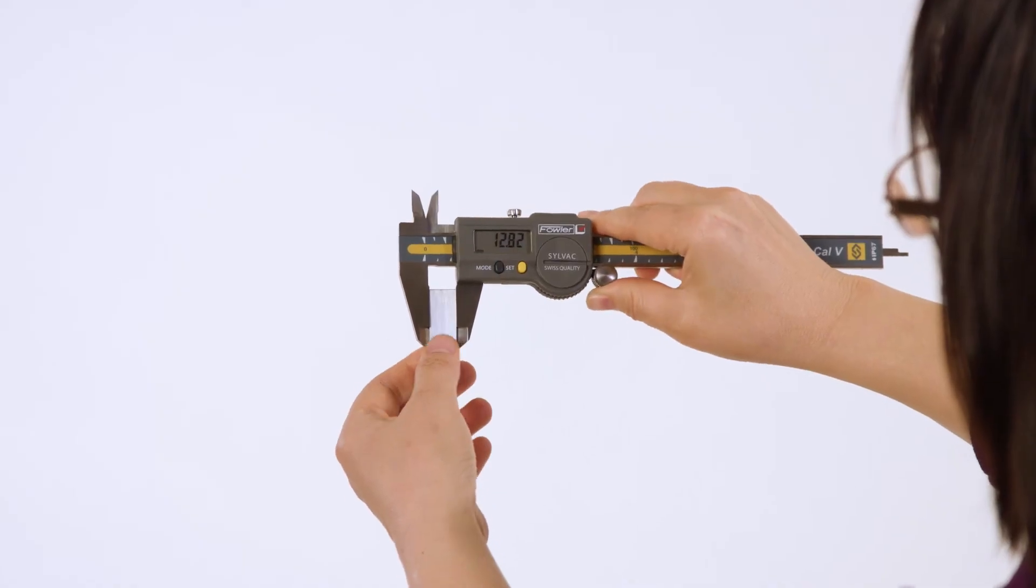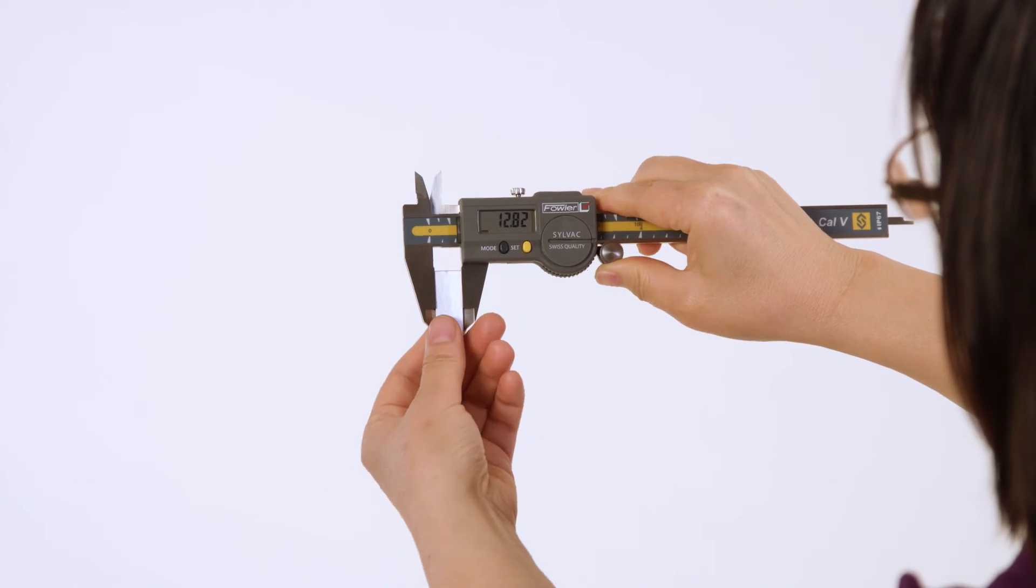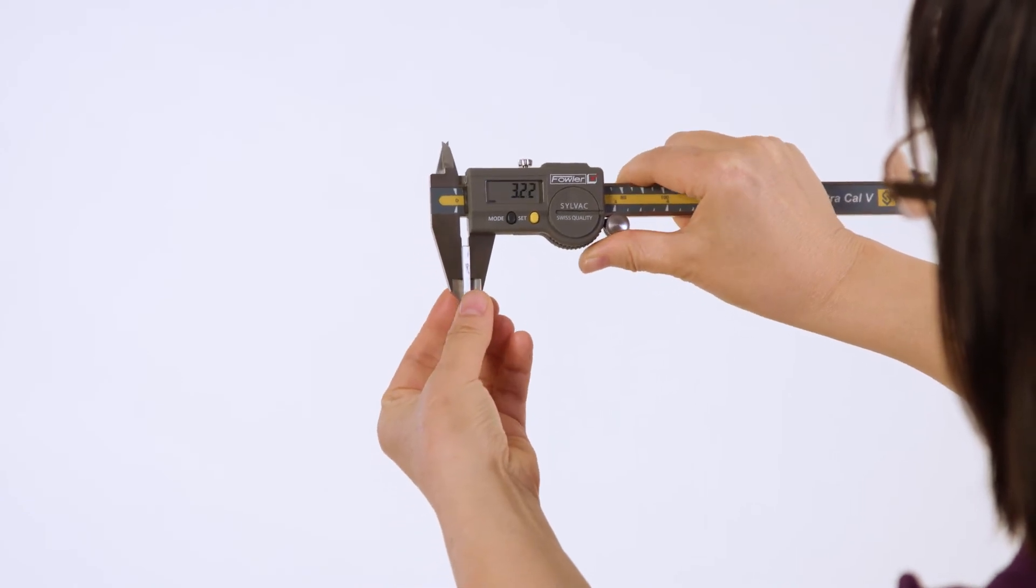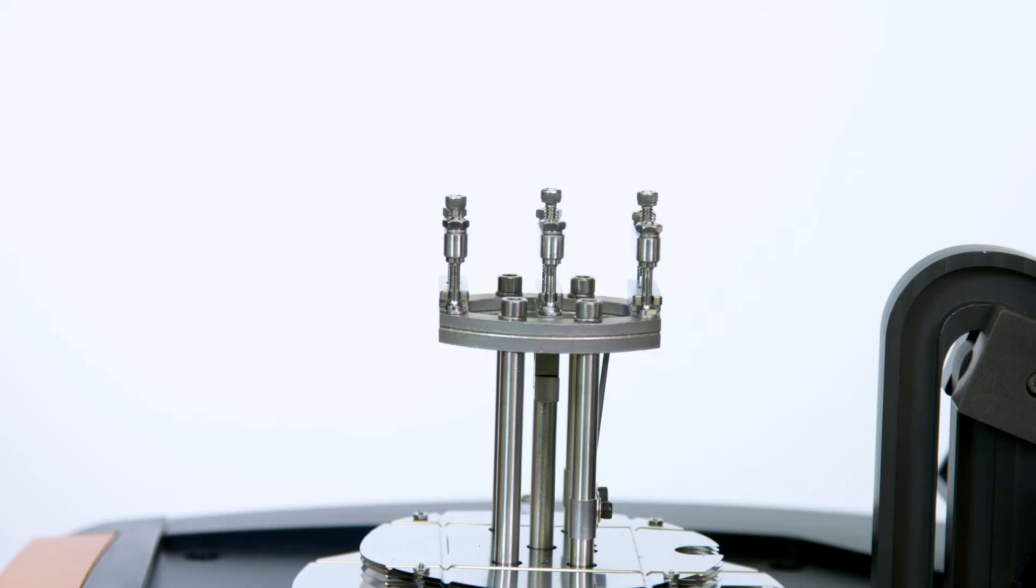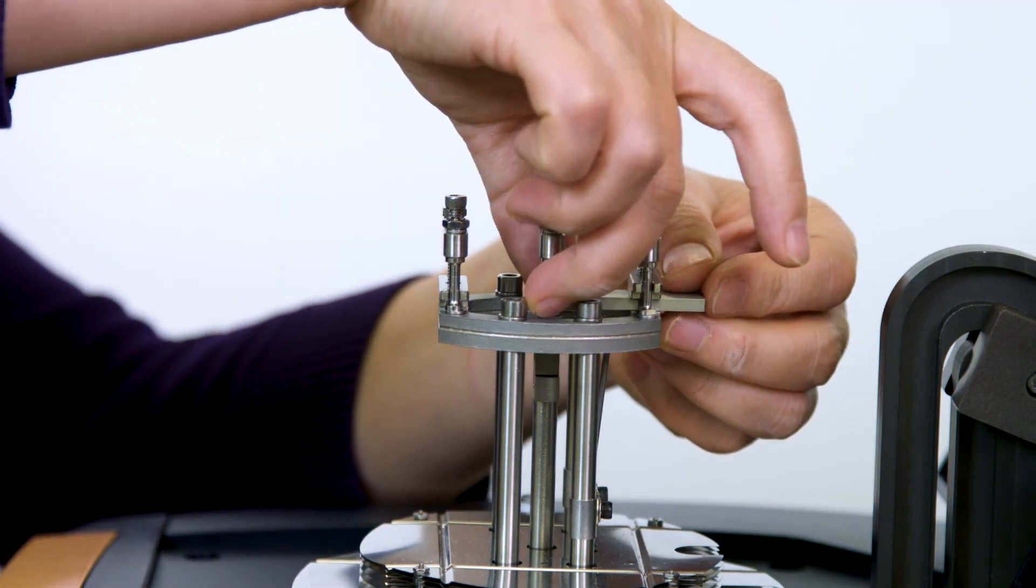Use a caliper to measure the width and thickness of this precision steel compliance sample. Then, mount the steel sample to the clamp using 8 to 10 inch pound torque.